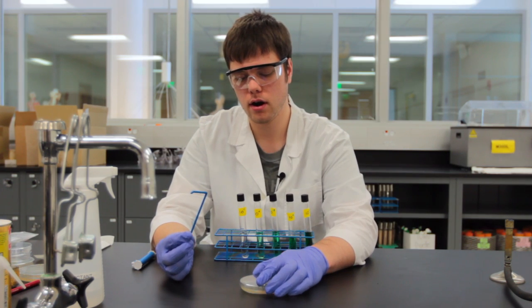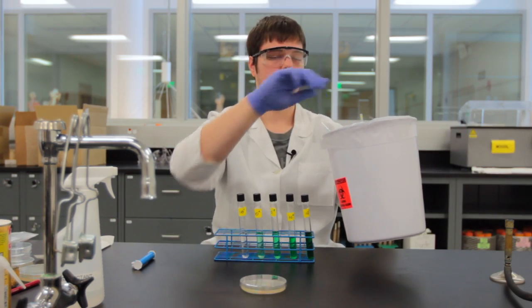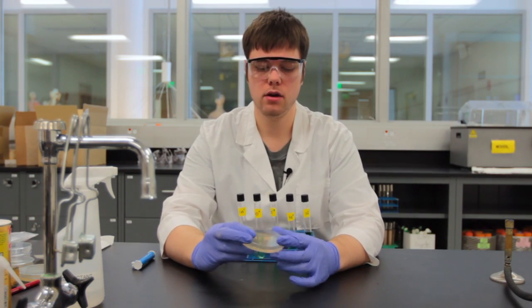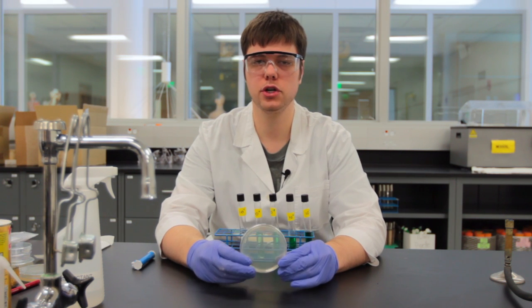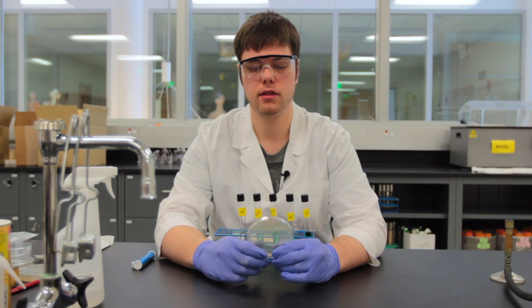We will cap our plate up, take our spreading stick and place it in the biohazard bin. We now have a plate with a 10 to the negative 3 dilution on it. We'll then incubate these appropriately in the incubator.